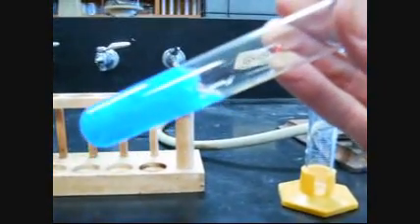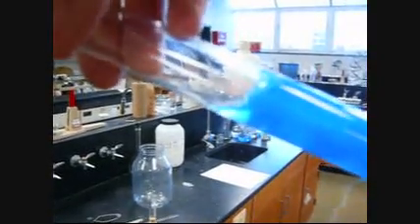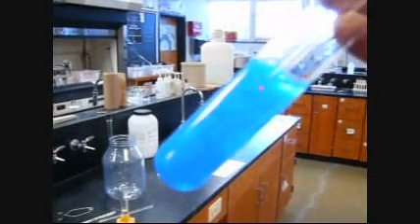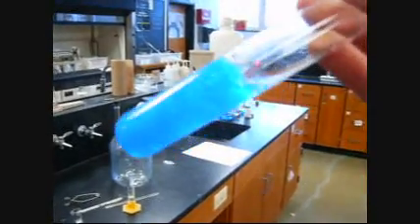So the whole thing turned into kind of a blue jelly apparently, but on closer inspection we find out that there's still liquid in there. There's still water present, but in the midst of the water is a kind of blue gelatinous, almost kind of a cotton candy look to it. Fortunately you can't see real clearly on this video, but that is what we call a precipitate, and it's a solid that has formed in the solution. Alright, that is the first reaction.